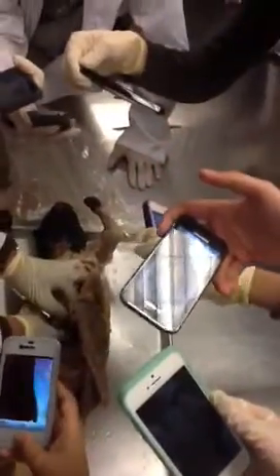We have a lesser omentum, lesser means smaller, right here on the other side of the stomach. So this is the stomach, a very big sac. From the stomach, the greater omentum; from the other side of the stomach, the lesser omentum. Do we see the lesser omentum? We actually see it. Can we take it out? No, we cannot take it because it is connected to the liver. It's already dead. Now something about the intestine.